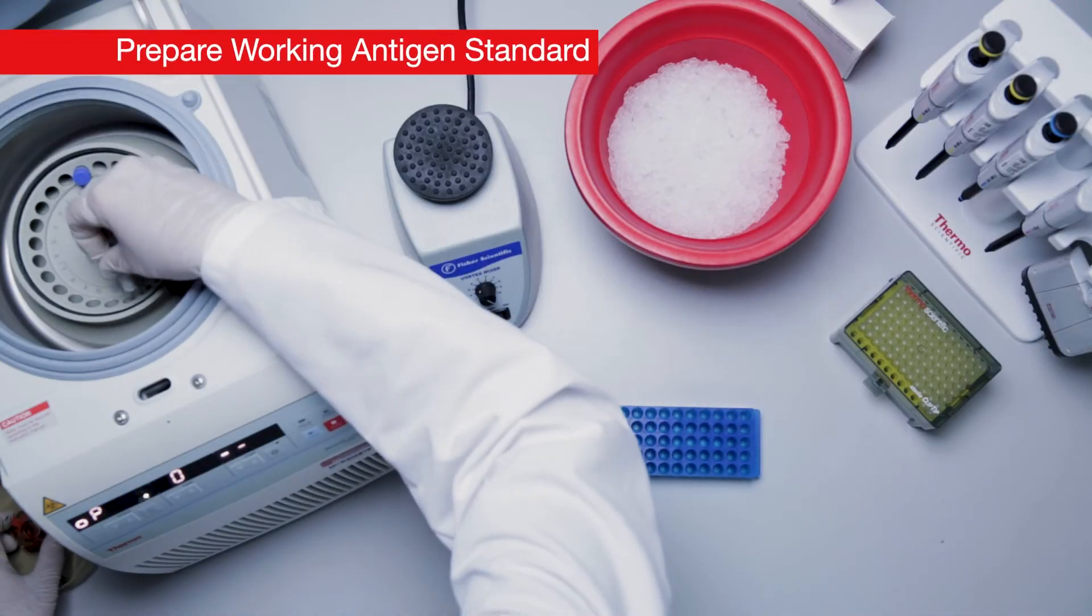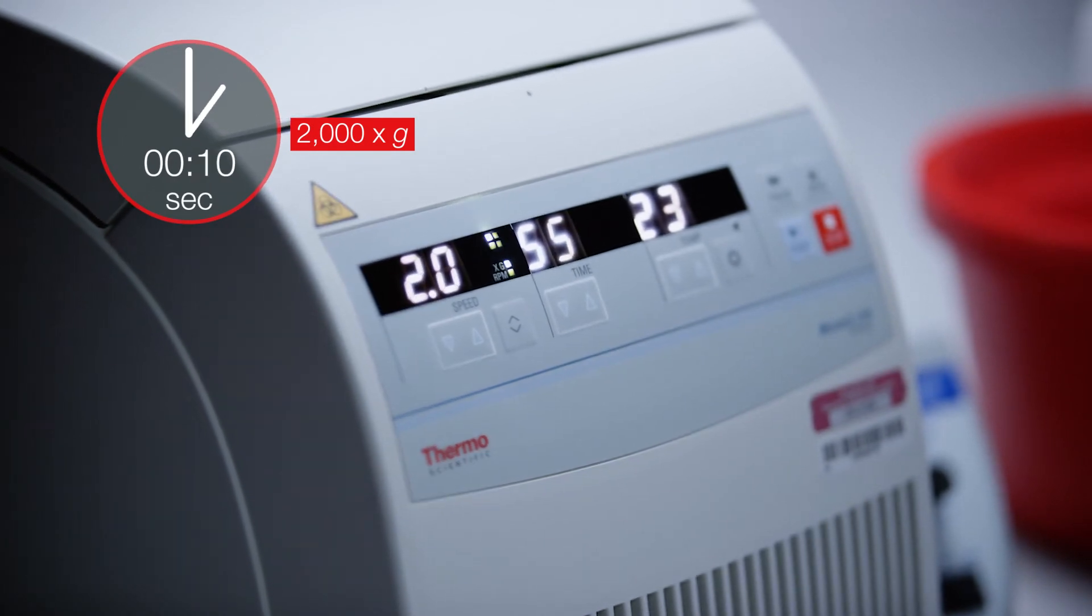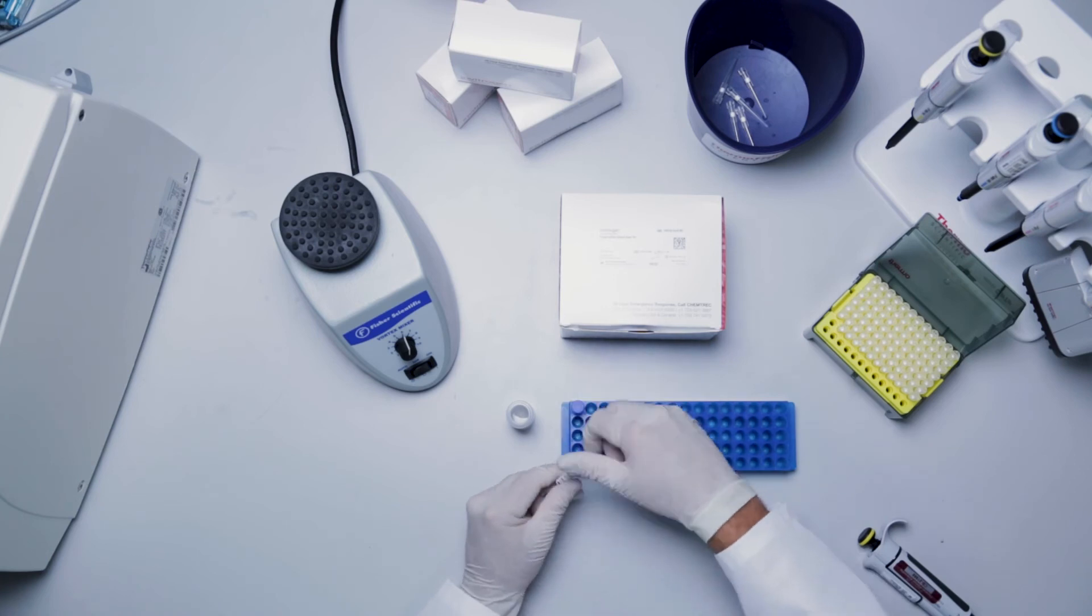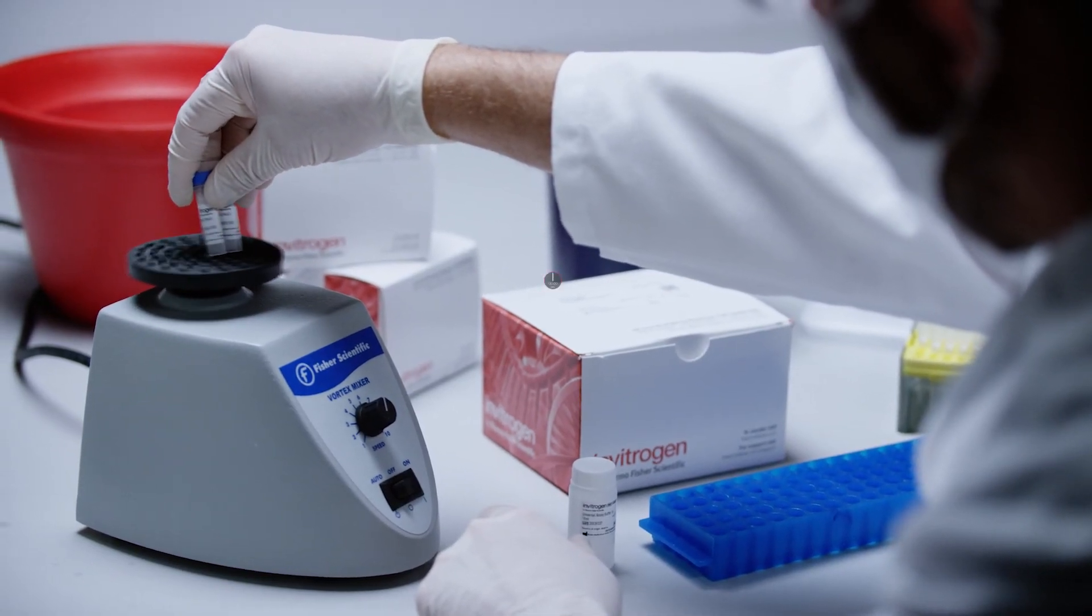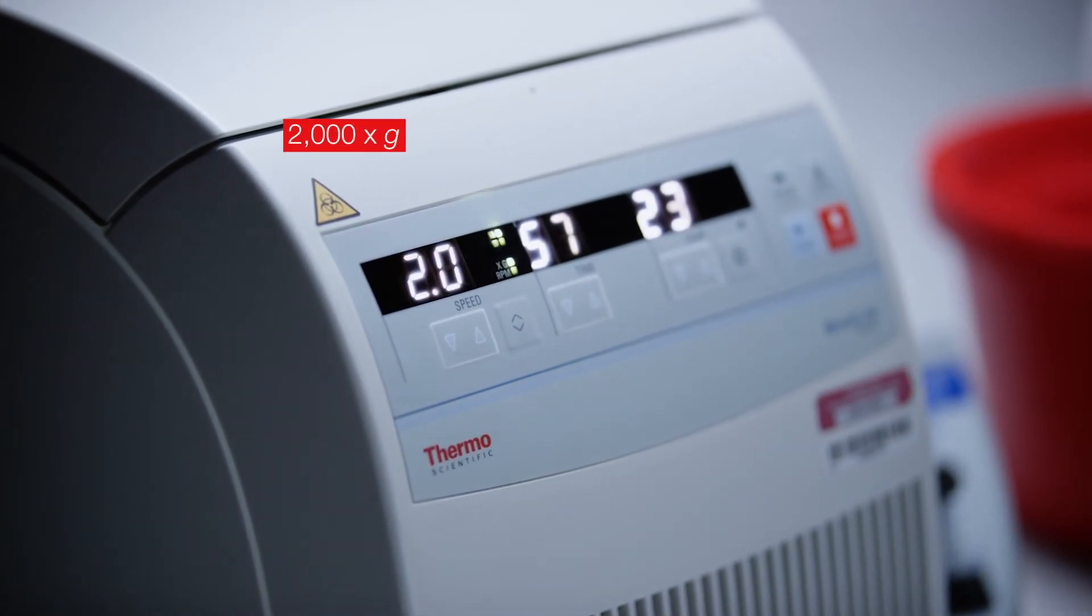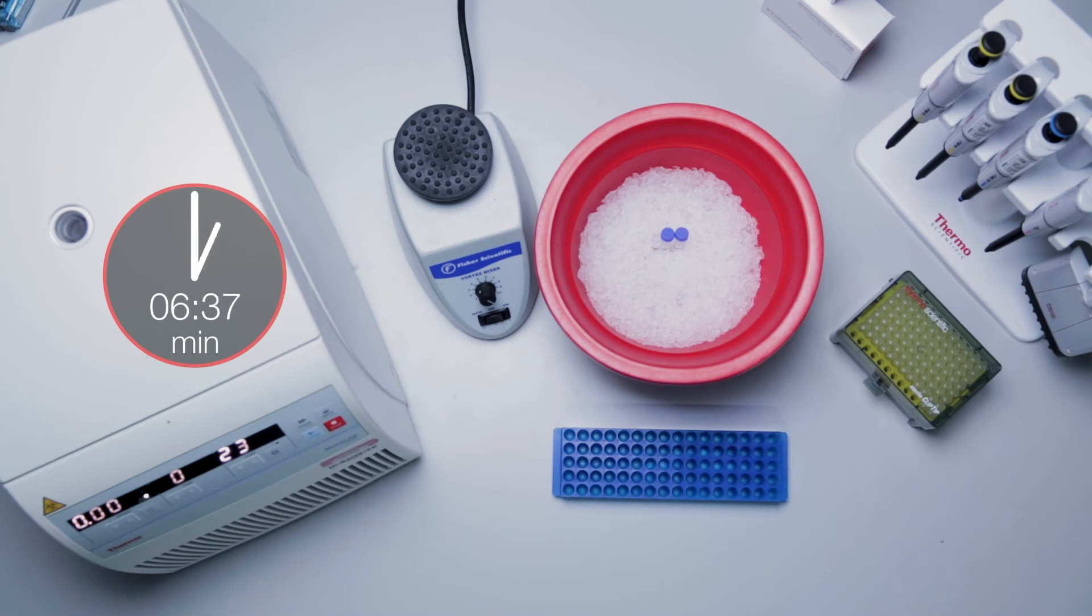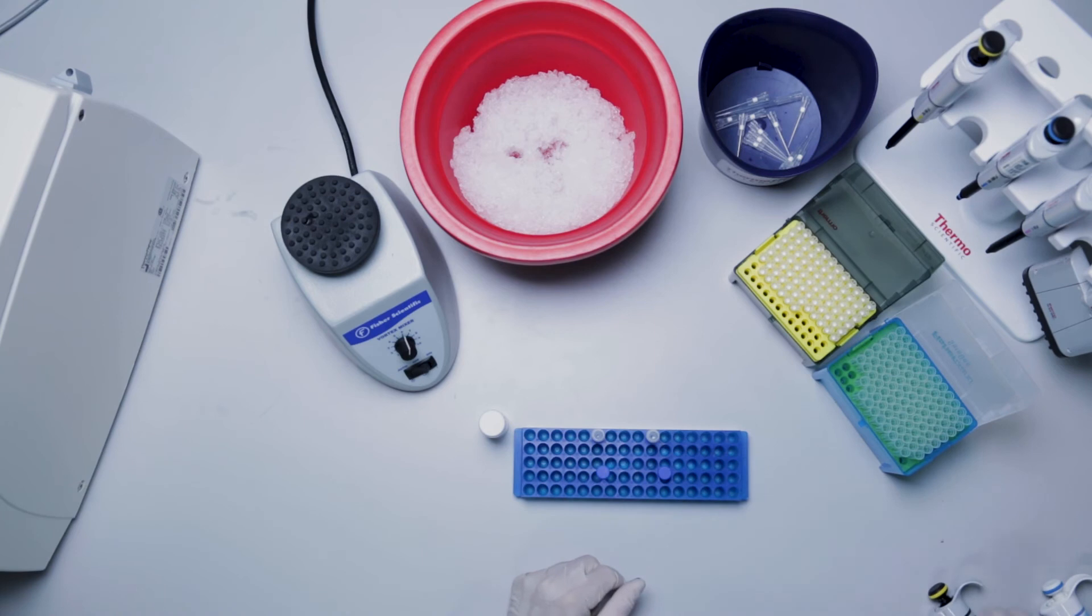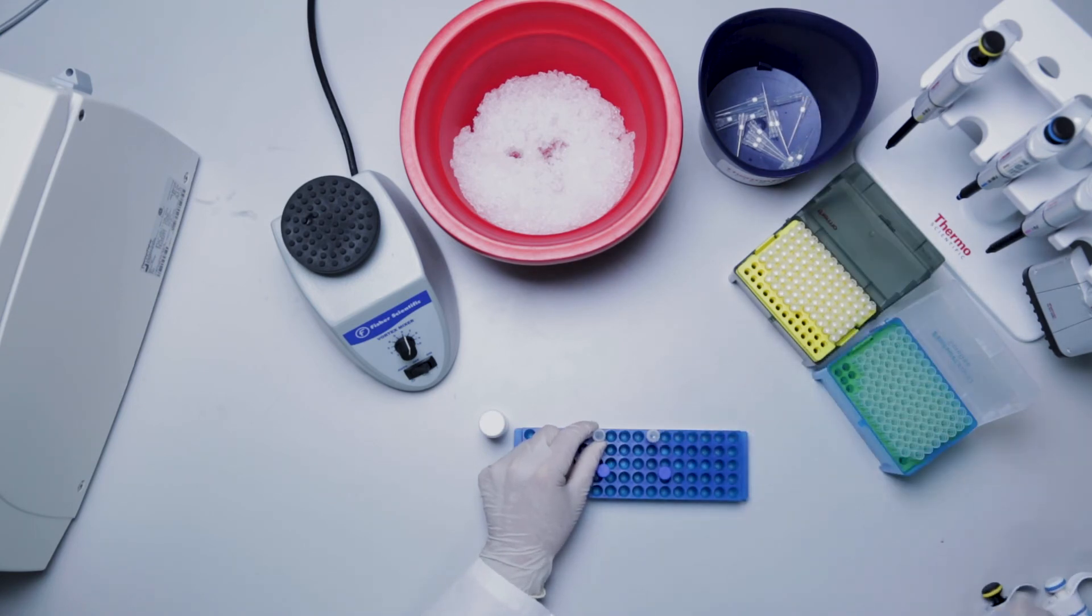Centrifuge each antigen standard vial at 2000 g for 10 seconds. Add 50 microliters of universal assay buffer or cell culture medium to each vial. Vortex each antigen standard vial at high speed for 30 seconds. Centrifuge at 2000 g for 10 seconds to collect the contents at the bottom of the vials. Incubate on ice for 10 minutes to ensure complete reconstitution. Pool the entire contents of each vial into one of the vials and fill with sample type specific buffer to a total volume of 250 microliters.